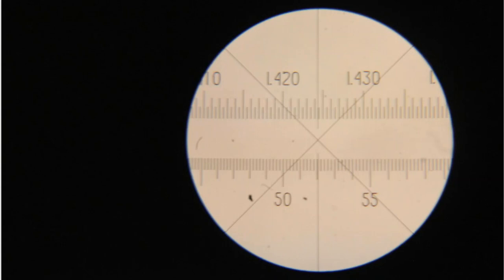Here's a couple of things about the meter. Here's the crosshair, right? And you can see this big line that goes straight up. All right, so that's the line that I'm going to read, folks. This one right here. So that means in order to properly provide a refractive index, I'm going to have 4 decimal places, 1, 2, 3, and 4. And I get those 4 decimal places from wherever the meter crosses that vertical line right there. The way that this meter is divided up, this is 420, right? Right there is 420. And this is 430.